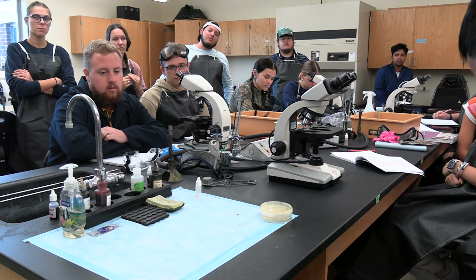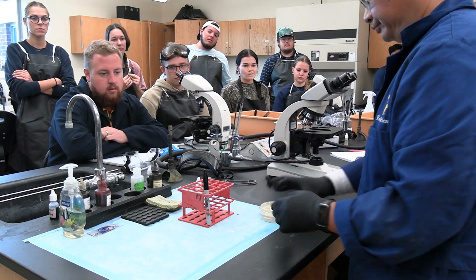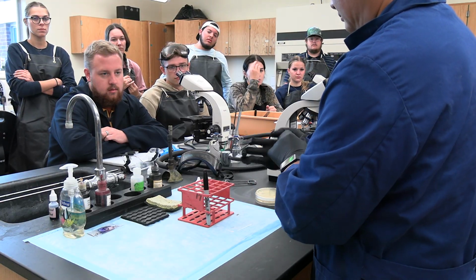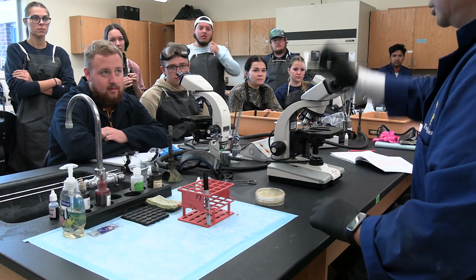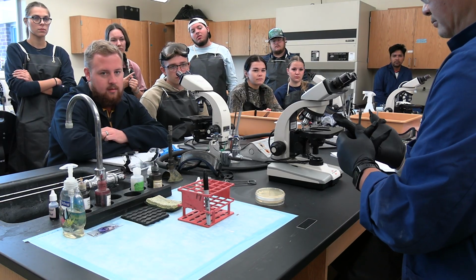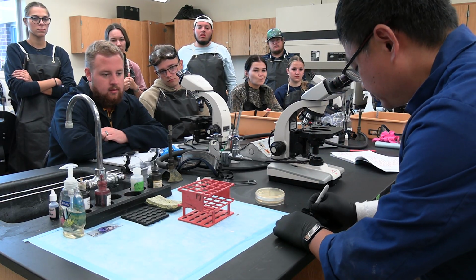First things first, I'll borrow 1 rack. We're going to be using new glass slides. You can use the old ones, that's fine. We're going to draw 2 big circles.